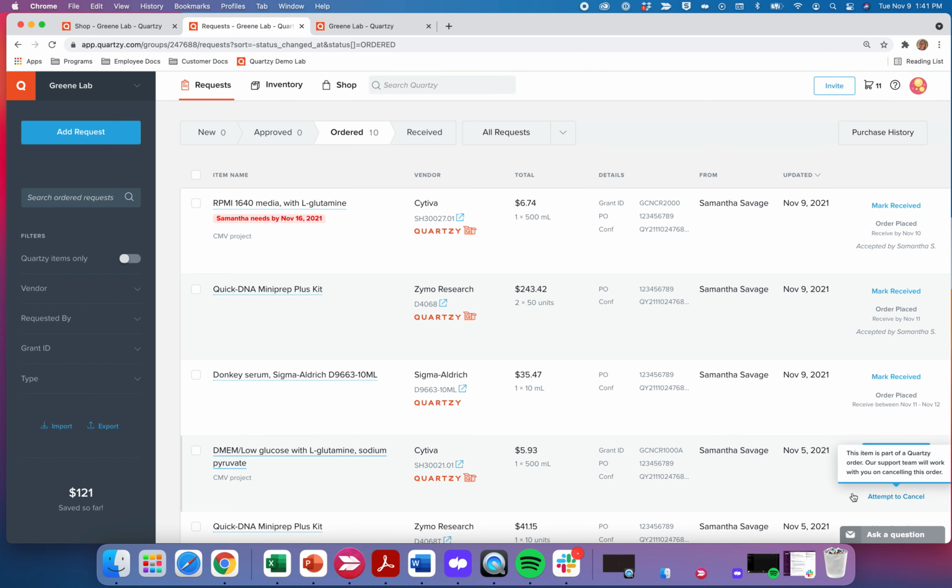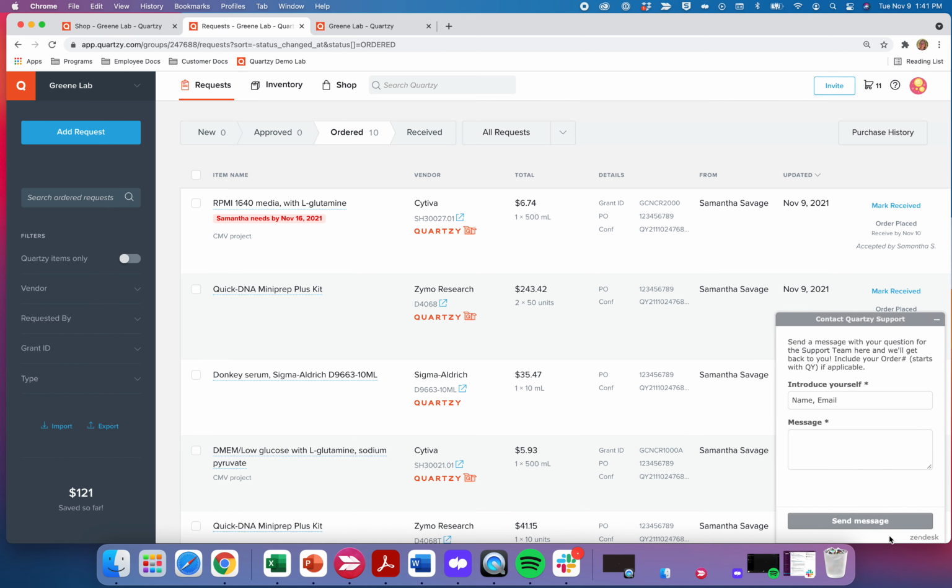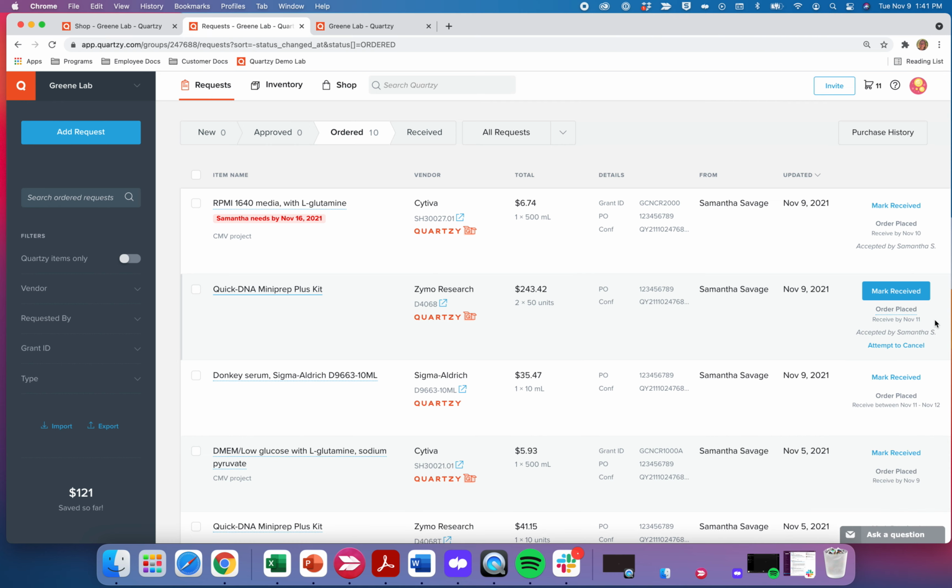If you have any questions about orders or things within Quartzy, you can always click the Ask a Question button, and you can reach out to our team. Please be sure to include that QY number if you're asking about an order.